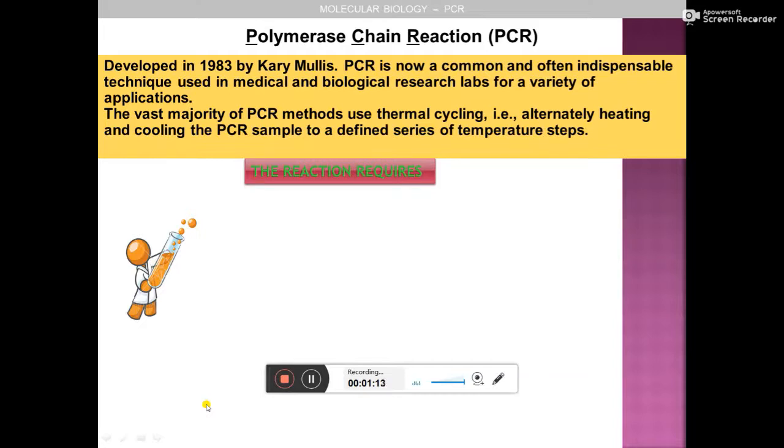So wherever the process of PCR is being used, the basic principle is just the same. That's because we make multiple copies of a small segment of DNA from the sample which we have obtained, and we check whether a particular gene of interest is there.